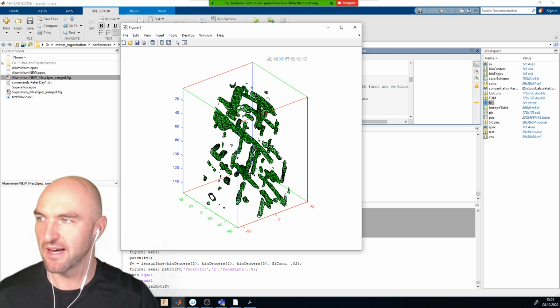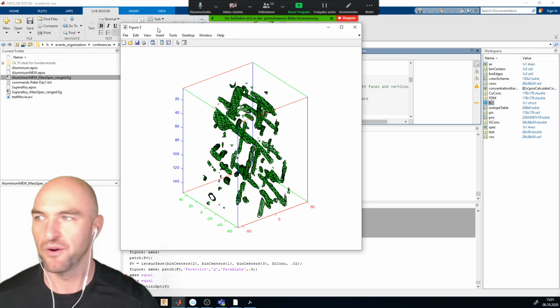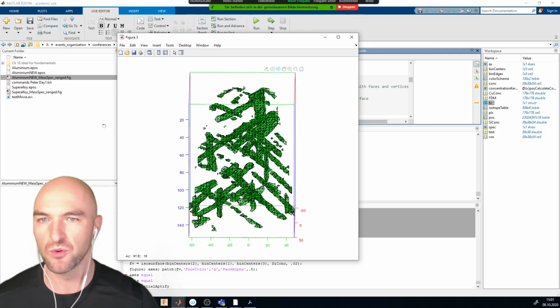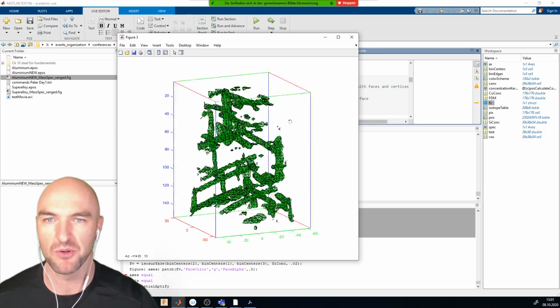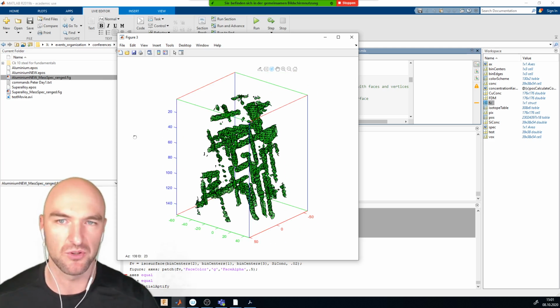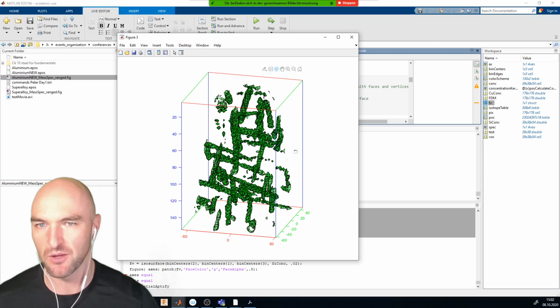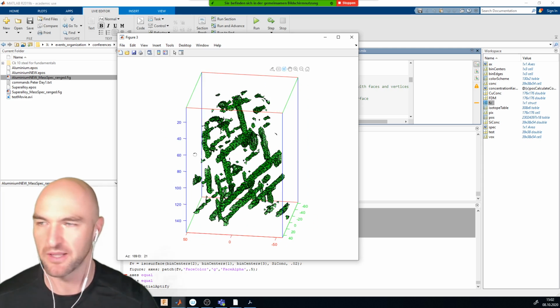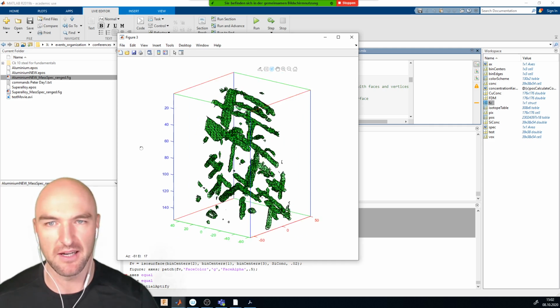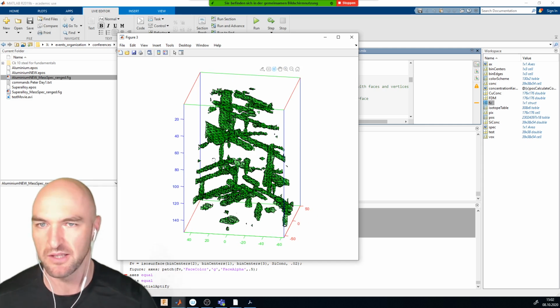So Hisham is asking if it's possible to filter isosurfaces on size. And this is absolutely possible, and tomorrow we will do a ton of that. We will look at how to split them up, how to filter them by size, how to treat them, how to do funky things with them. So there's a ton of those things that we can do, and we will get to that tomorrow. Okay, but with that isosurface, I will leave you for today and leave you in Konstantinos' hands.